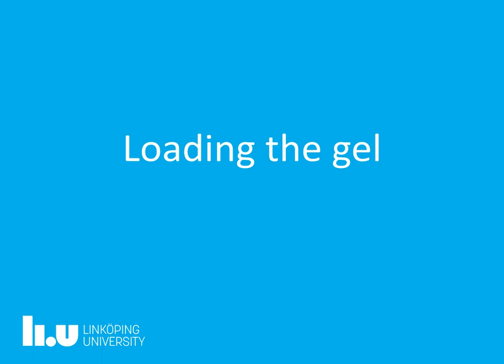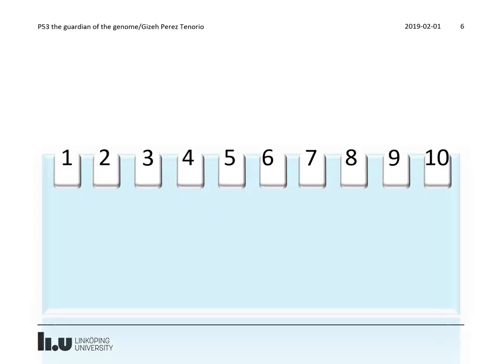There are some things you have to think about when you are loading the gel. First of all, it is important that you know how to load your gel and in which order. Your gel has 10 wells. The first one and the last one you will load with the molecular weight marker.